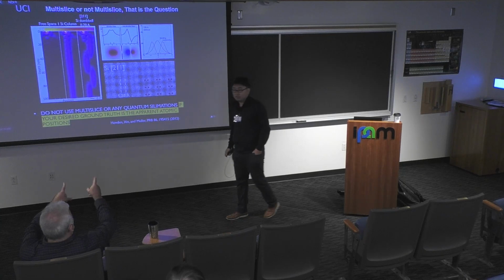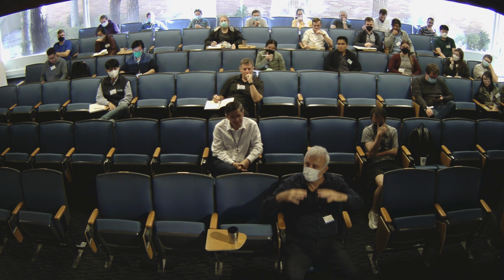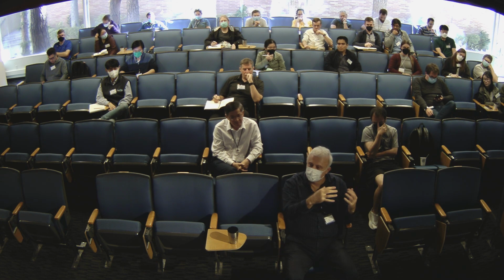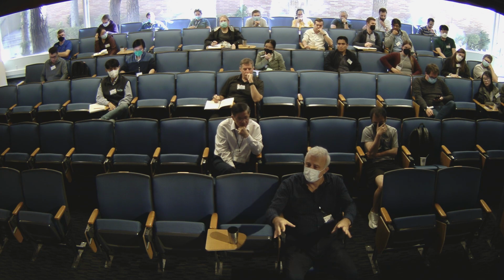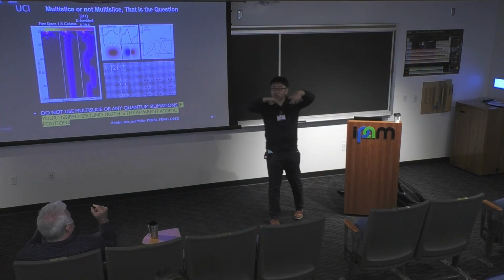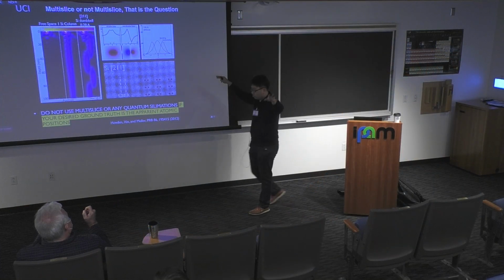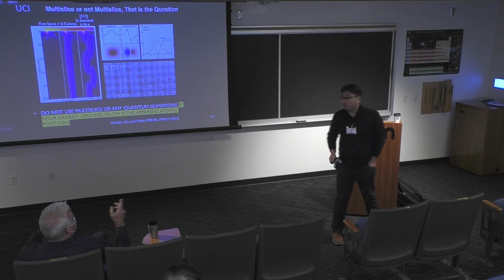Okay. I first want to disagree with you because the multi-slice at least mimics somehow the right diffusion process. That's one thing. So if you exclude that, well, just for the diffusivity, the background, you could just blur the images with a Lorentzian tail. That will give you exactly the same contrast, whatever contrast you want.